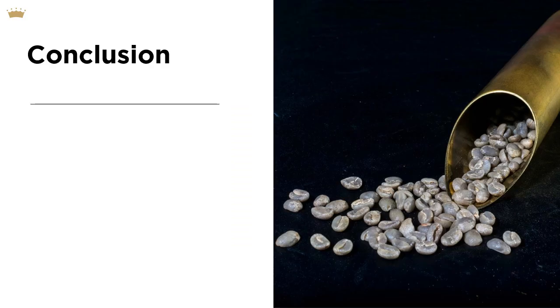This is the conclusion of a 4-part series called The Physical Analysis of Green Coffee, and the 3 other parts in this series are also available online for digital learning. Whether we're dealing with moisture content or density or screen size or the physical defect count, quality and value can be improved across the board by using well-calibrated equipment, employing attention to detail, and using the physical analysis of green coffee to augment its cupping score.